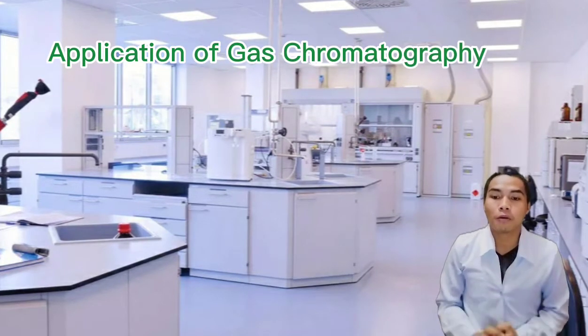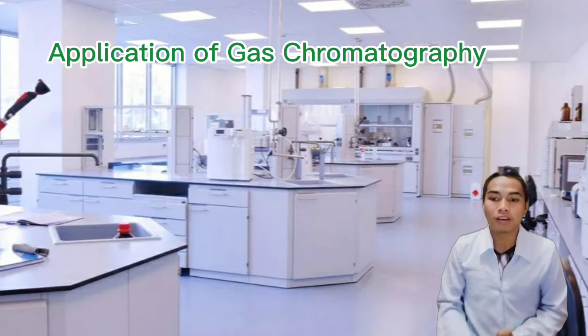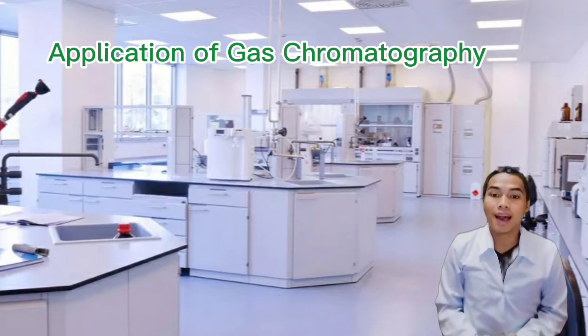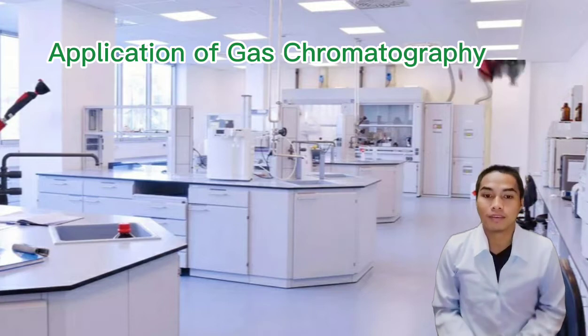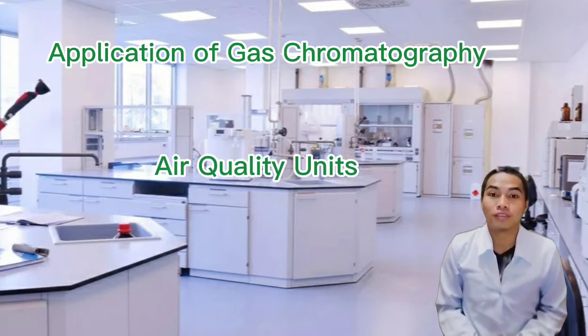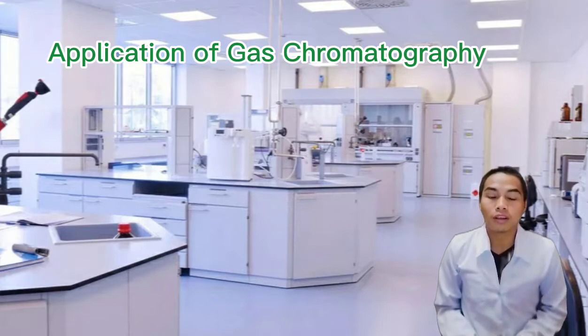Application of gas chromatography. Gas chromatography is a physical separation method in which volatile mixtures are separated. Knowing the amount of each compound in a given sample gives a huge advantage in studying the effects on human health and the environment as well. Air samples can be analyzed using gas chromatography. Most of the time, air quality control units use gas chromatography with FID in order to determine the components of a given air sample.